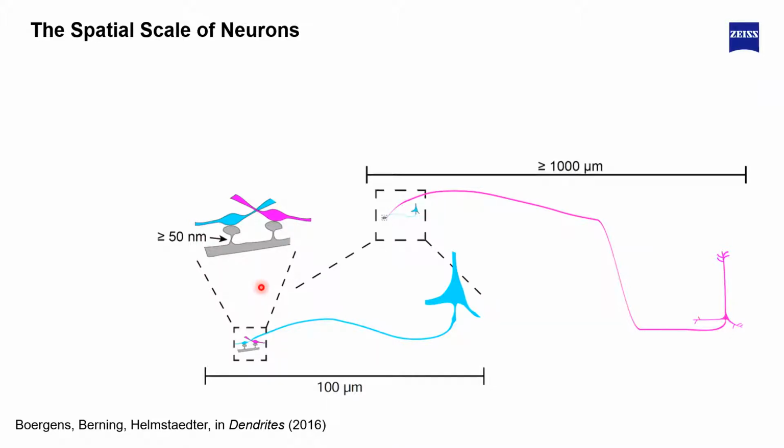So in the field of neuroscience, there's a subfield that's called connectomics. And in that field, the researchers want to map the connections of the brain, meaning which cells are connected or getting connections from that purple cell, from that blue cell, and ideally also all the other cells that make up the synapses formed on that gray cell.